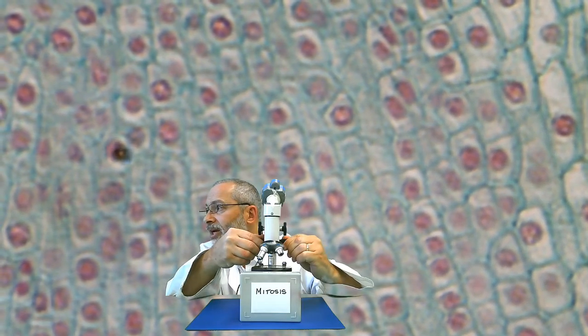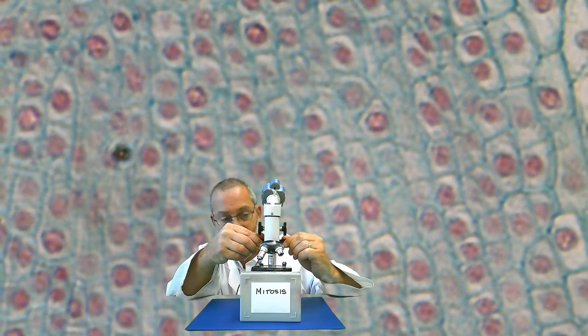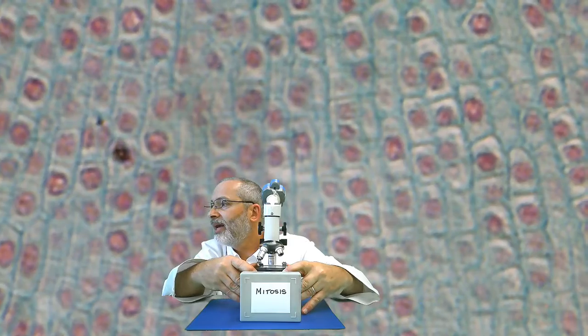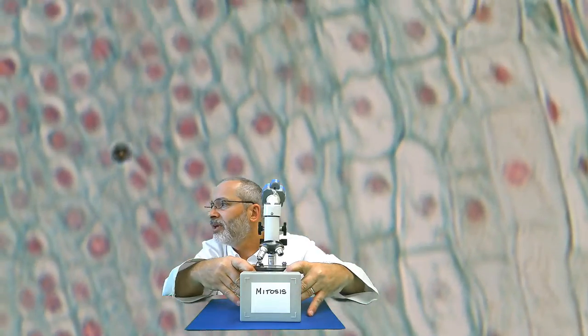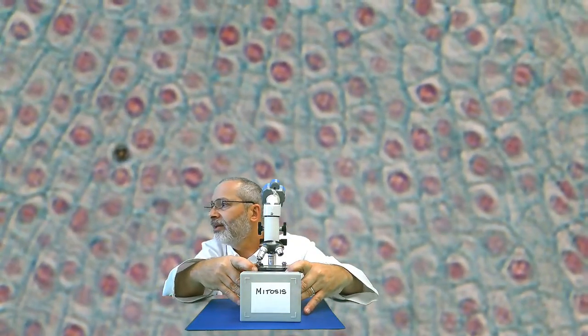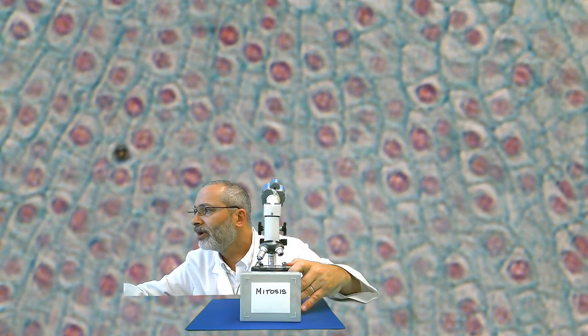And wow, check it out. We are actually now able to see a little bit more going on here in our slide. And again, we want to hunt around, move the slide around as we have zoomed in a little bit more to see if we can find, and by the way, I don't know if we can see it on this image, there's a little spot here.